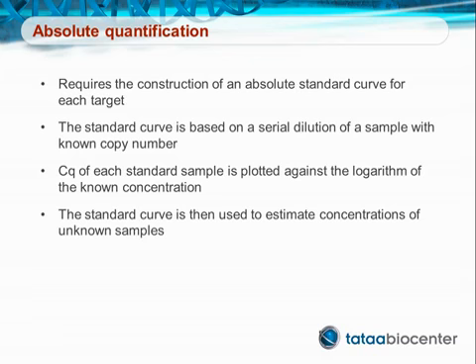The serial dilution is used to generate a standard curve, and from that we can determine the concentration of our unknown samples. Since we are always comparing our unknowns to a standard, the concentration we determine can of course not be better than the standard we are using. So, what is required of the standards?